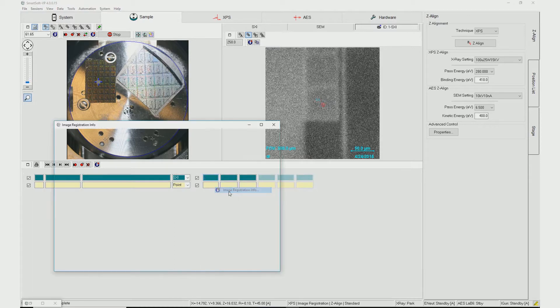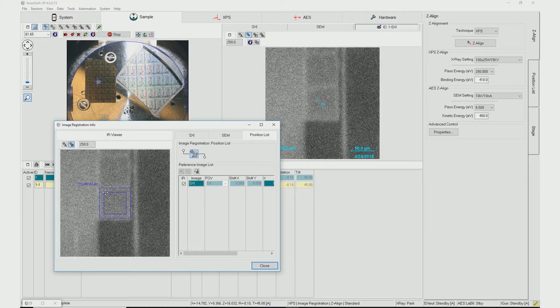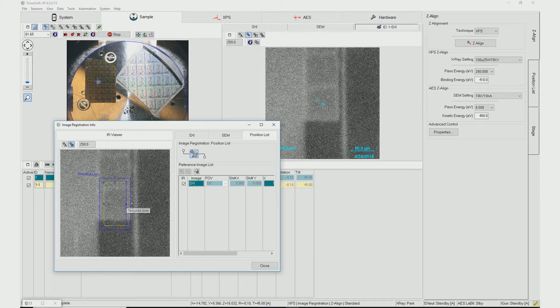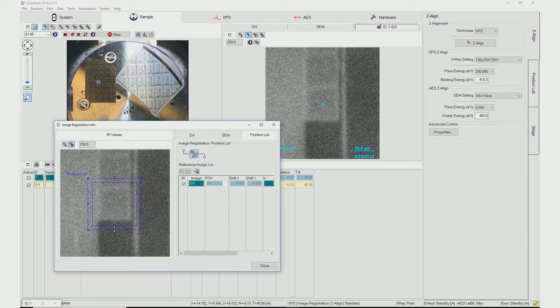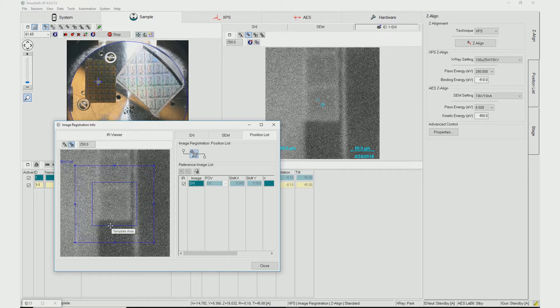During Image Registration setup, two areas are defined: a distinct feature and a search area. The distinct feature will be used to adjust the X-ray beam position to the correct location after a stage move or during a long acquisition. The search area is a constrained region in which the X-ray beam will move to reposition itself in order to find the distinct feature.